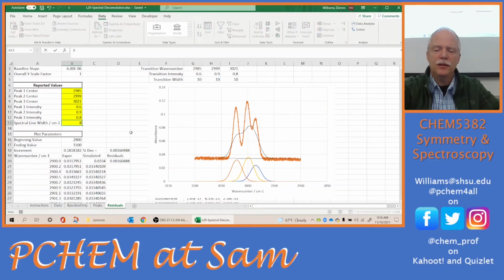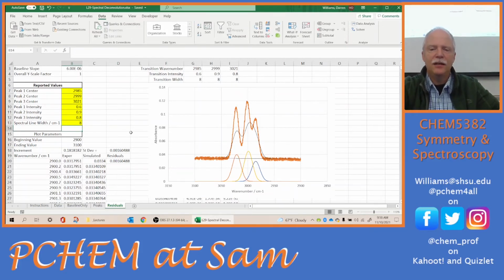So we'll just go slowly. I'll go 8. No, not good enough. 5. Yeah, that's pretty good. It looks like we have a peak width close to 5 wave numbers. Okay.